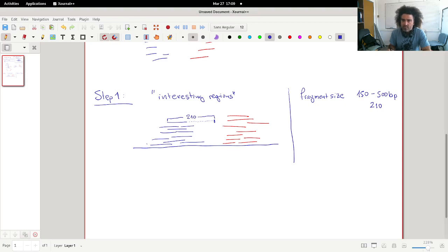And we do the same for all reads on this side. So the 3' end, remember that this is the 5' end of this read, so the 3' end is here. Now again this one will be 210 base pairs. Okay, by extending all the reads, what we will eventually manage to have is more reads, higher depth actually here, because we have extended everything. And from this side.